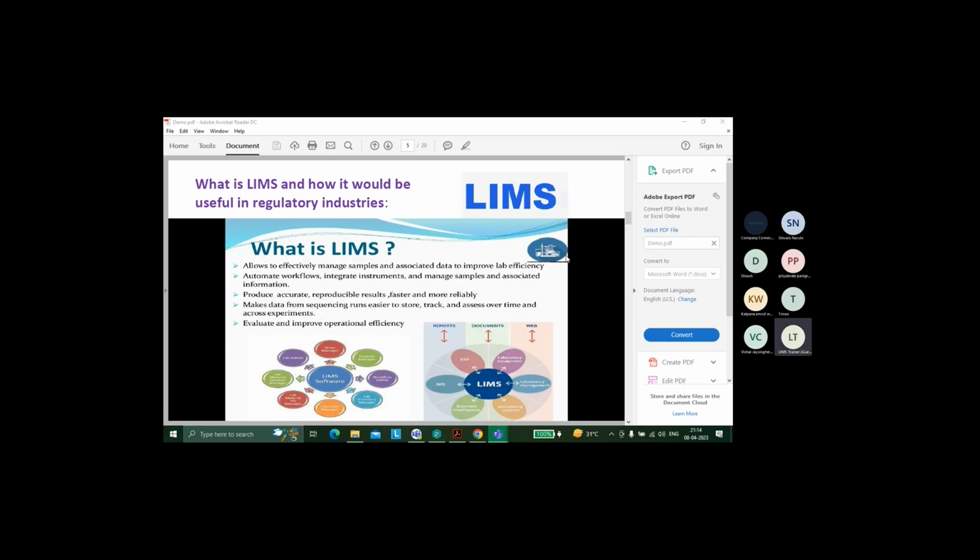So there are different types of LIMS, and India is also coming up in this LIMS market. We have Labware and LabVantage offices here in India, and Sample Manager offices as well. One more thing: LIMS is not only used in the pharma industry. It is used in other industries as well: pharma and biotech manufacturing, clinical health, veterinary, chemical and petrochemical, food and beverage, and commercial labs. So the scope of LIMS is very big, and you have a lot of career growth here.